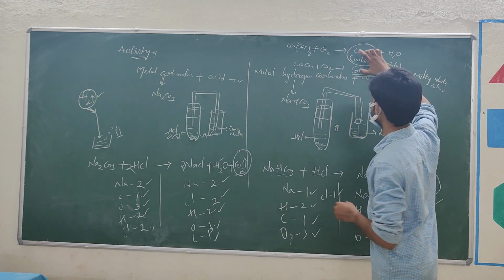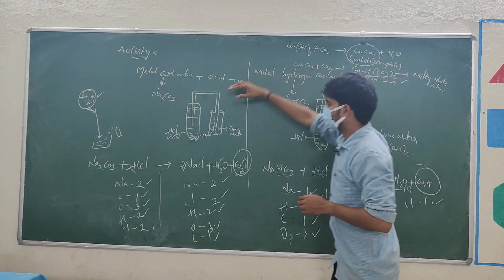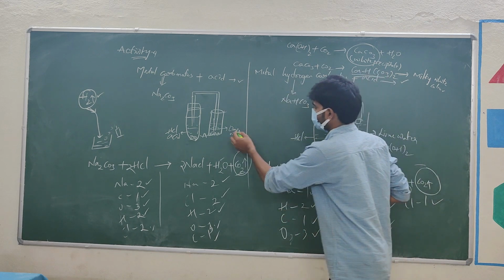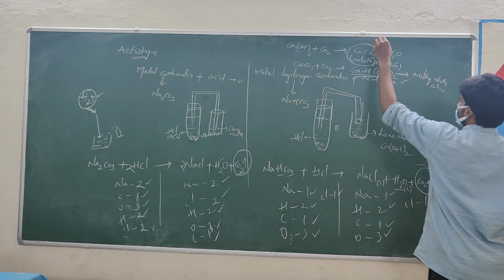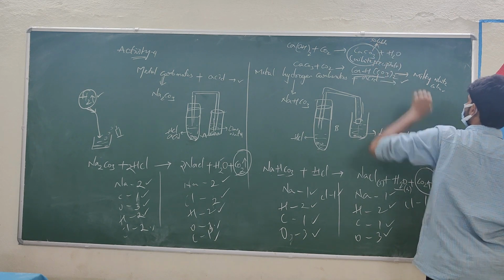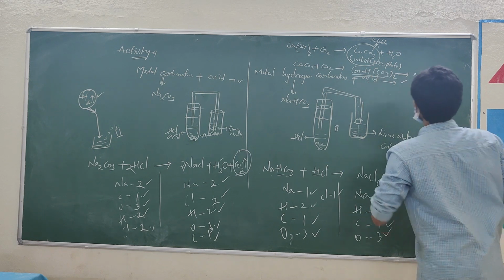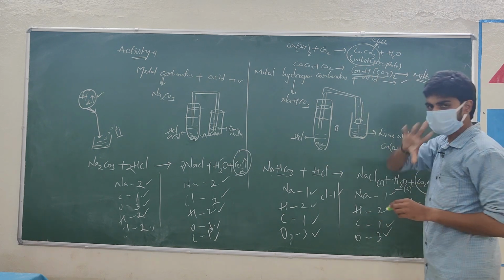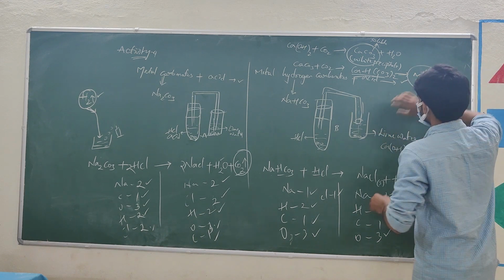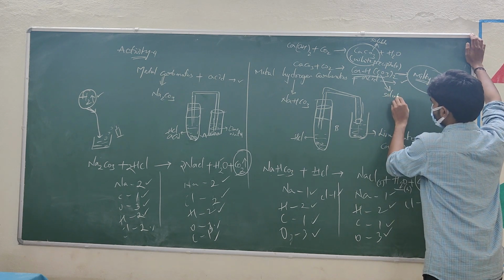Now the major difference between these two is, when CaCO3 is formed, the white precipitate gets deposited at the bottom of the flask, right? It is not soluble in water. But when calcium hydrogen carbonate gets formed, it gets mixed with the water, and we get an overall milky white solution, right? So that means calcium hydrogen carbonate is soluble in water, okay.